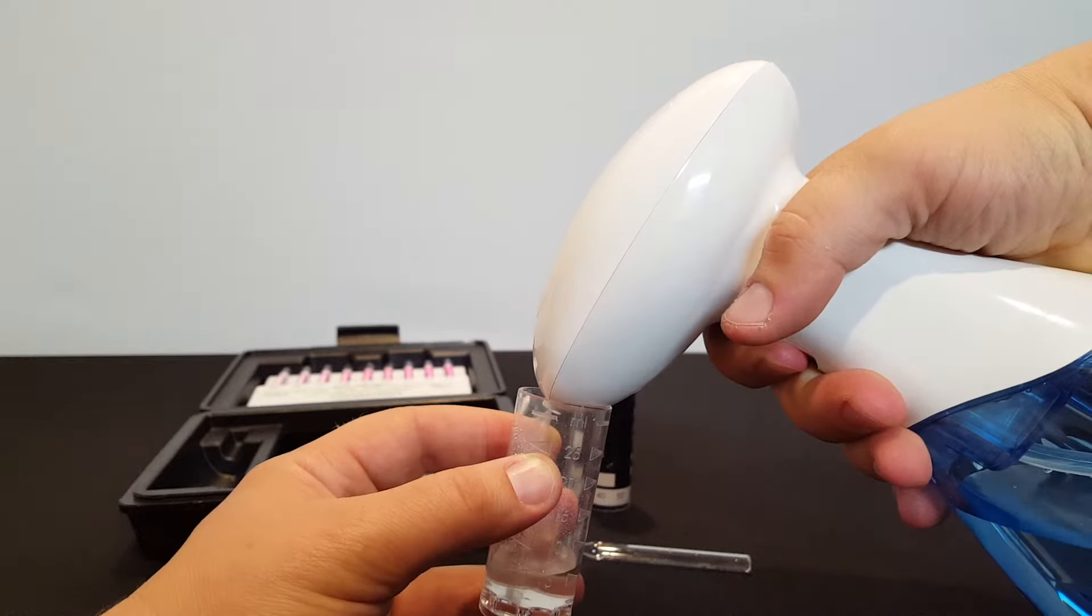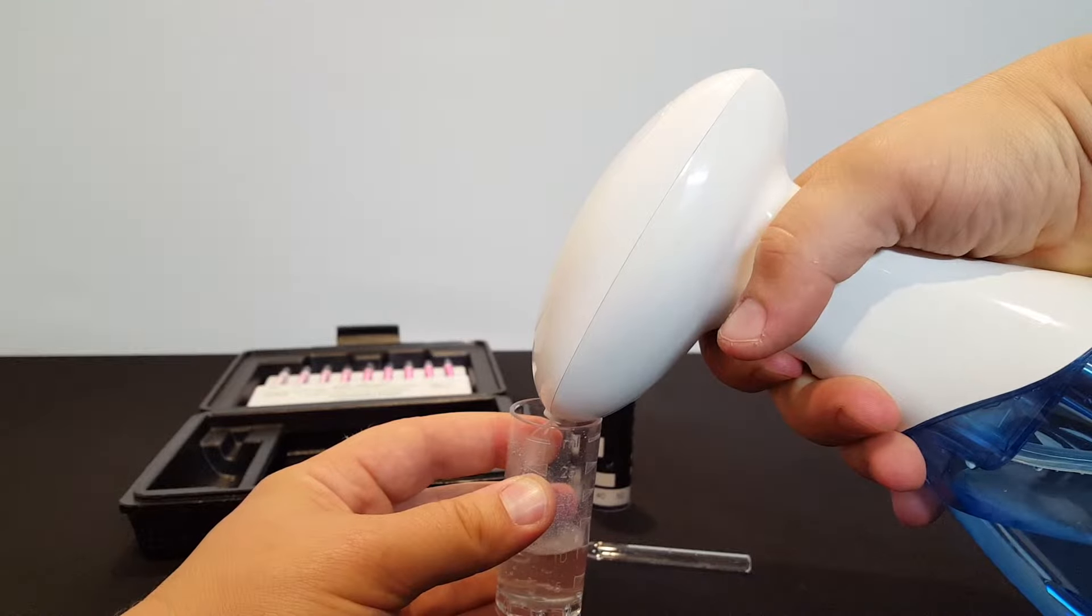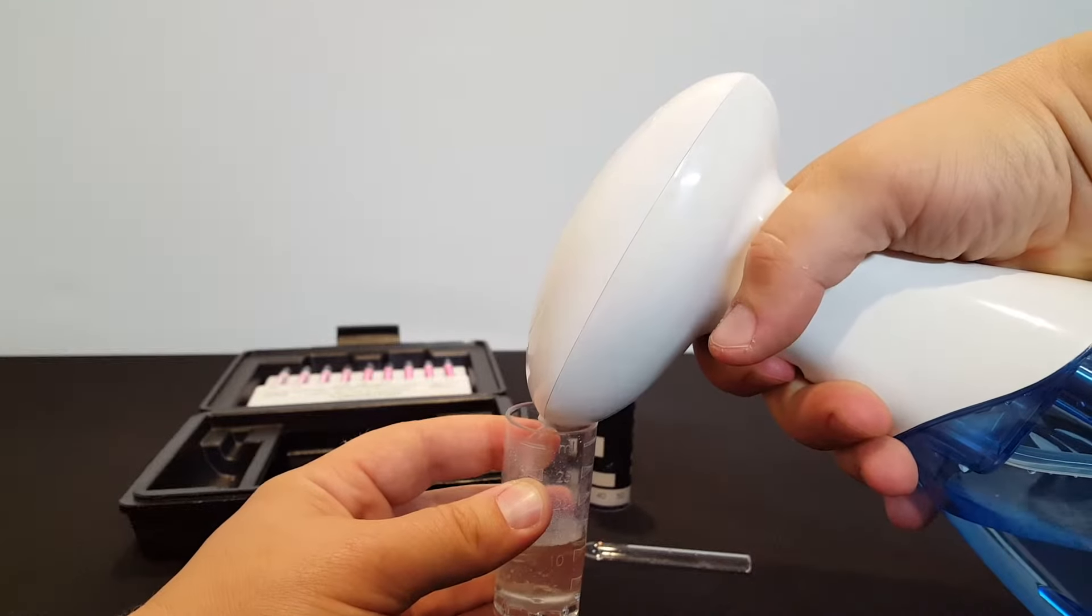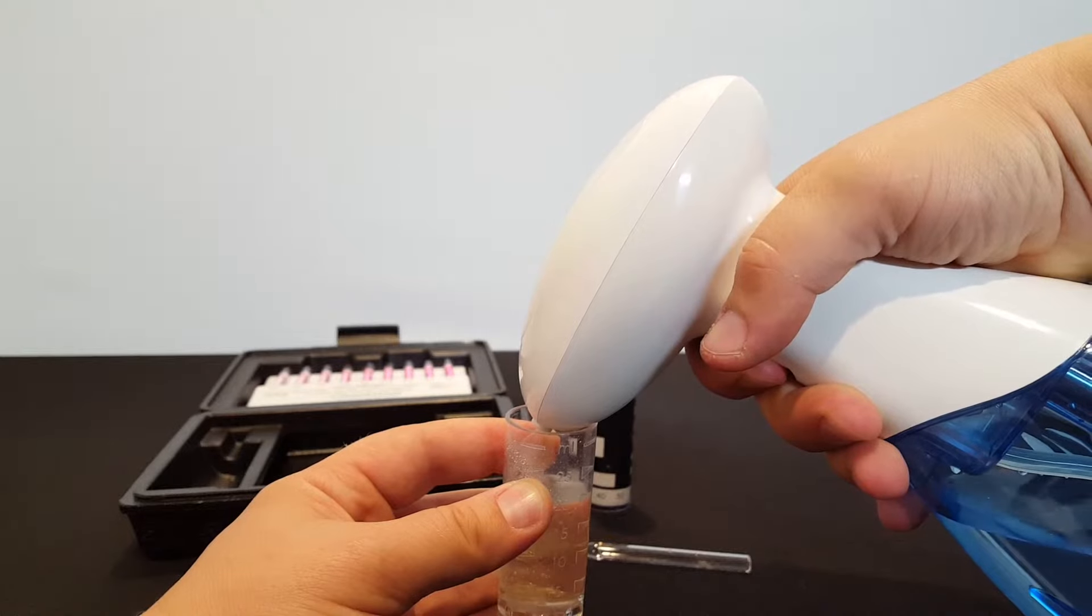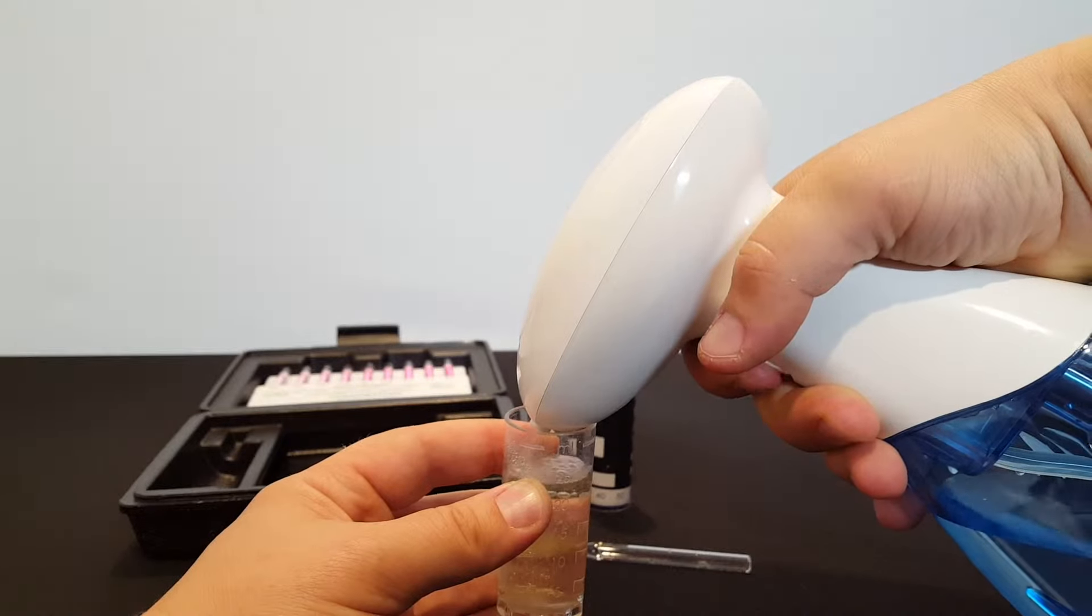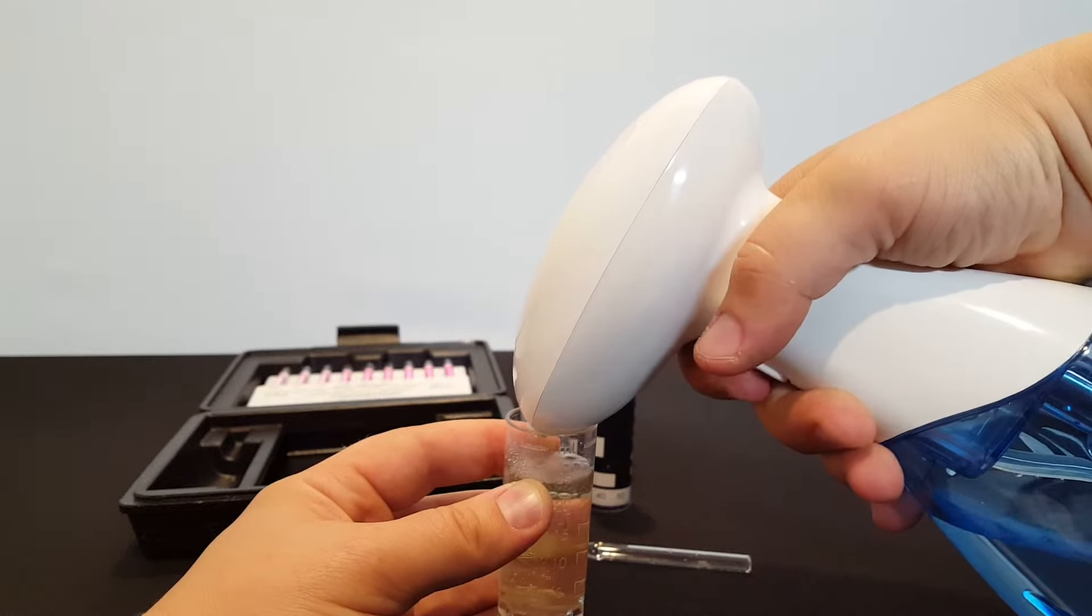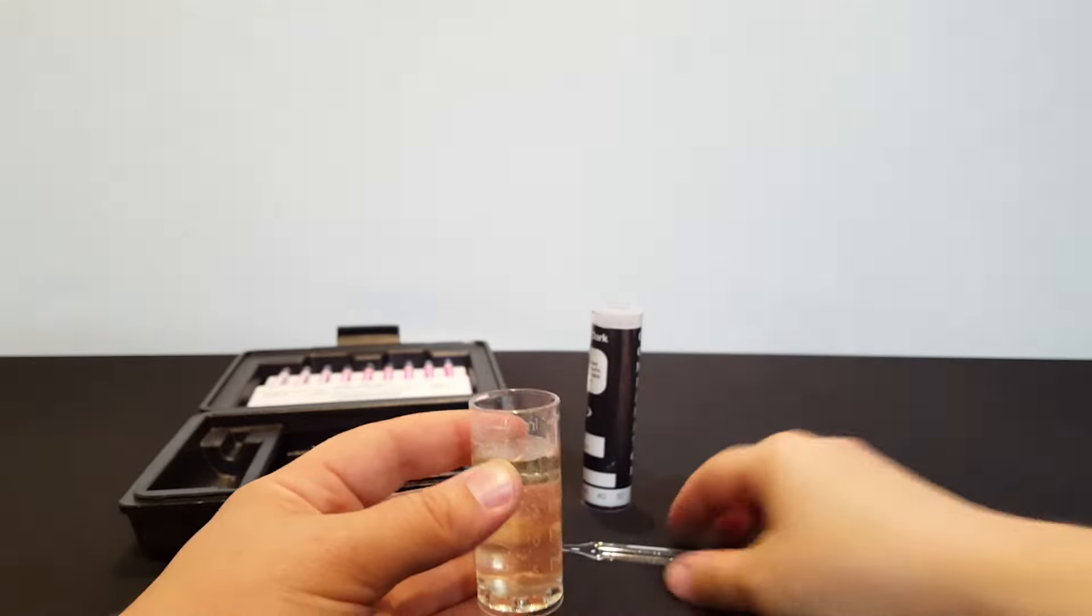The reason this part of the test has to go quickly is because the dissolved ozone starts to break down almost immediately. And we need to have it in the ampoule before the ozone starts to break down to ensure an accurate test.